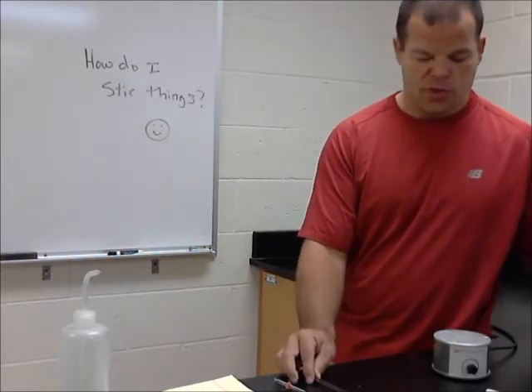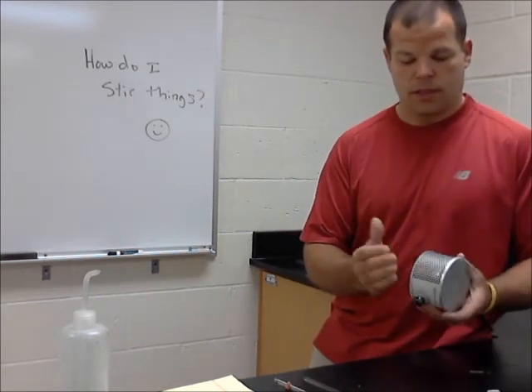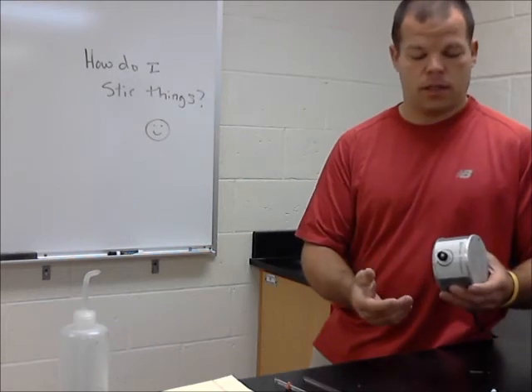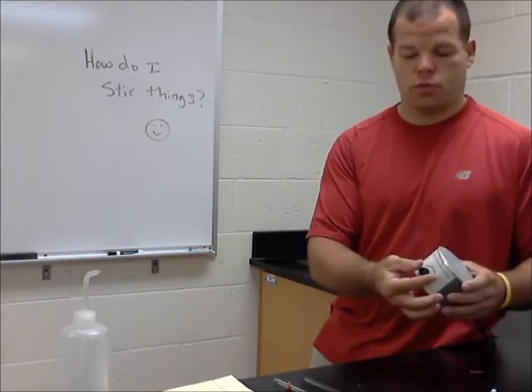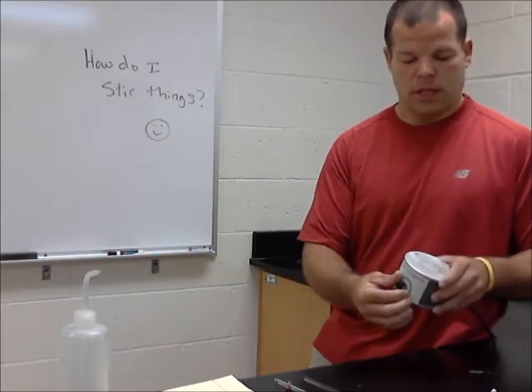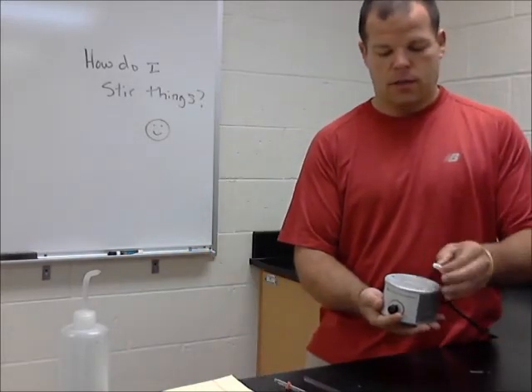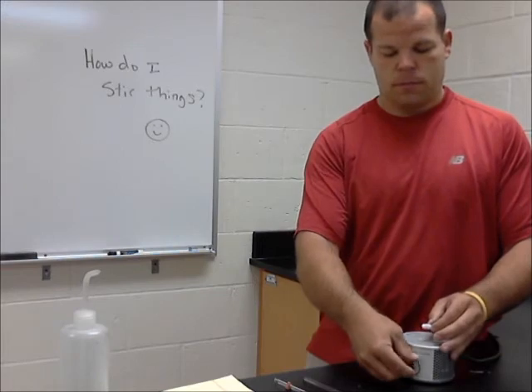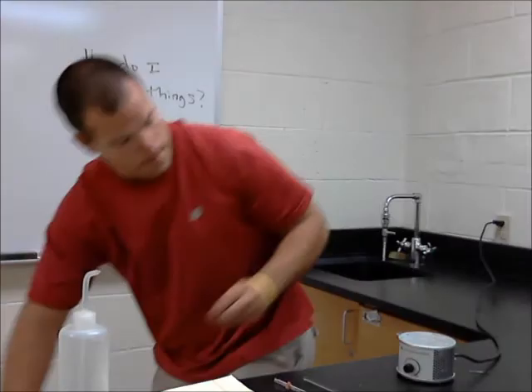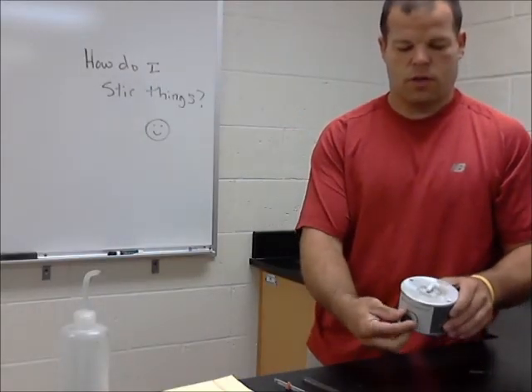A more fancy way to stir something is what's called a stir plate. This is a stir plate. All it is is a magnet inside with a piece of metal hooked to a simple electric motor, with a little rheostat in the front that just turns this piece of metal around. I set a magnet on top and it will go flying, but given the opportunity it will just simply turn around and around and around.